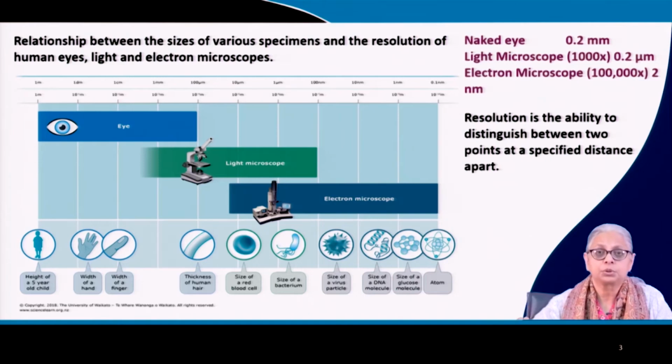You can see a protozoa. The protozoa is easy, much bigger, and easy to see. RBCs, which are 10 times larger, are also easy to see. But here we are near the detection limit of the light microscope. So it's kind of difficult to identify bacteria under a light microscope. For that, we have another method, and that is electron microscopes.